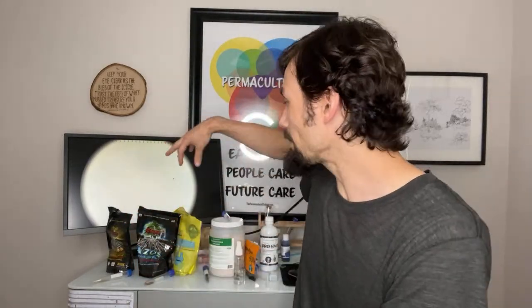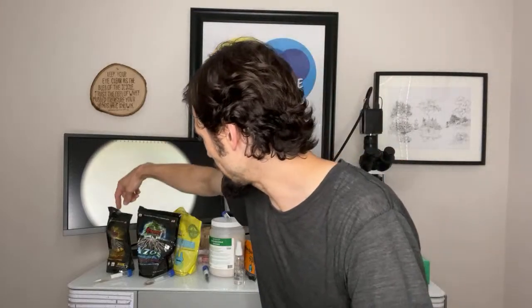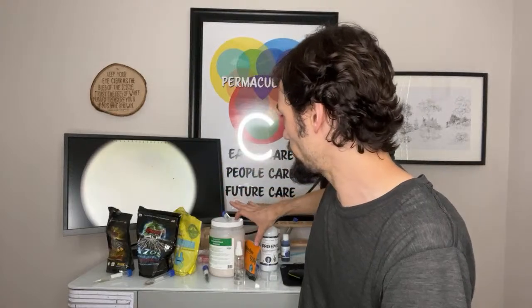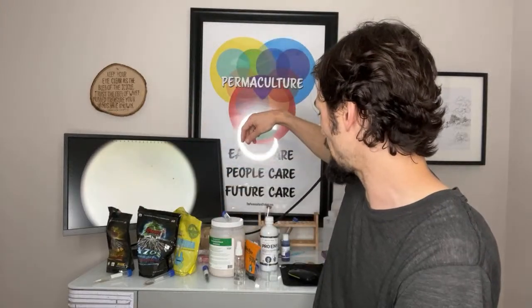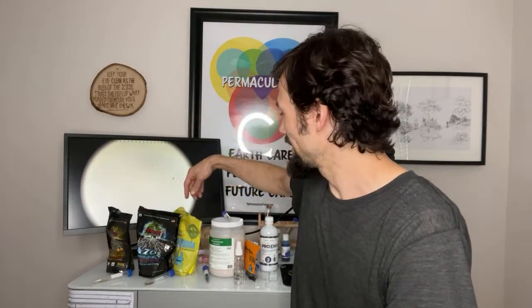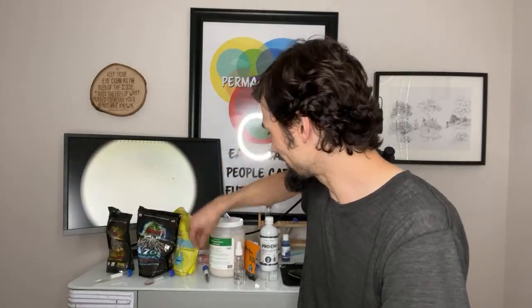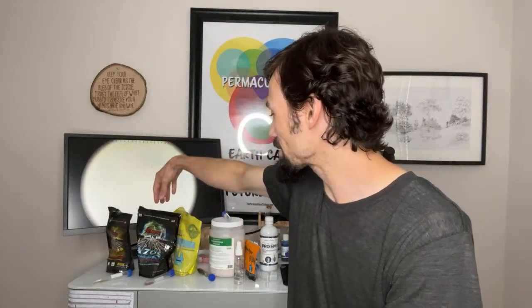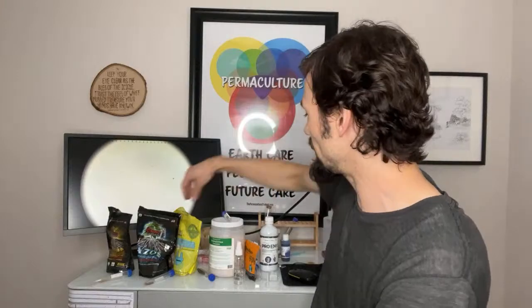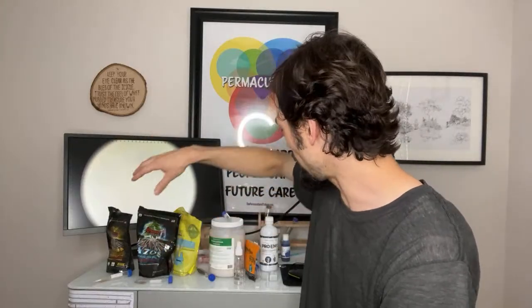Because some of these, this and this, are gonna look alike. These two and this will look alike, I would say. This won't look like anything else, because there's molasses in it. So it's like cloaked in mystery. Because, right, jet black, right? And then this is azospirillum. This is going to look different than all of these as well.